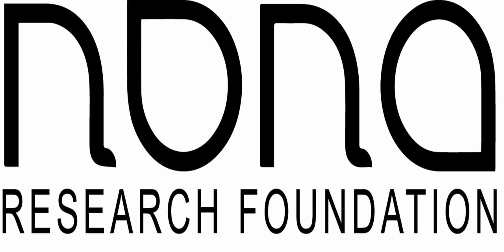And I think some of the critical challenges that we faced, which George mentioned in the introduction, were really around the different regulations. So the three that I wanted to mention this morning were we needed to take into account HIPAA requirements around patient information for staff, and then we needed to also include regulations for FERPA, which is a student-specific set of health regulations.